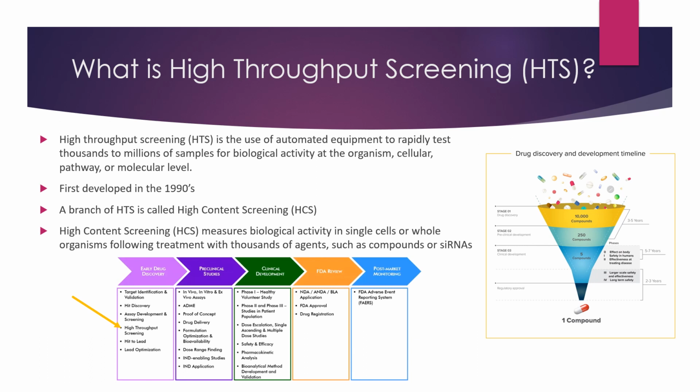HTS and HCS employ different technologies, including sample preparation, automated analysis equipment, supporting detection reagents, data processing software, and bioinformatics. HTS falls under early drug discovery in the drug development pathway.